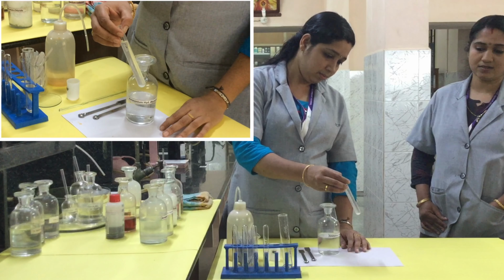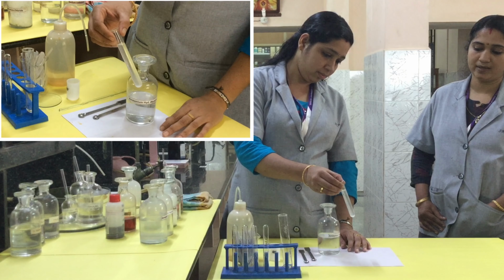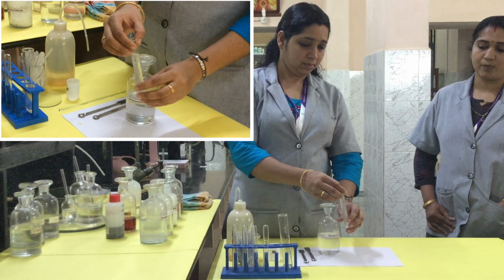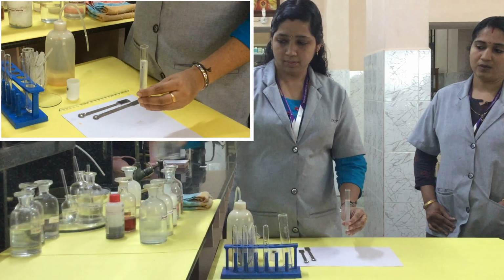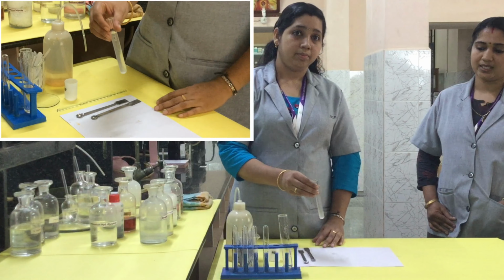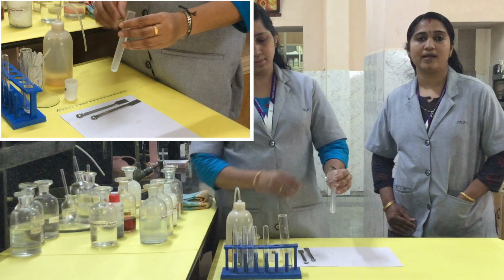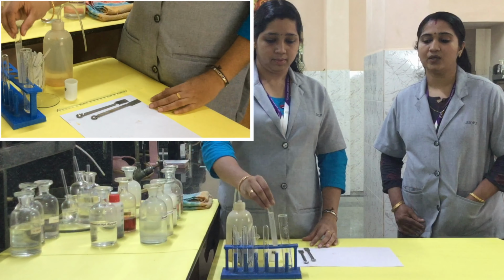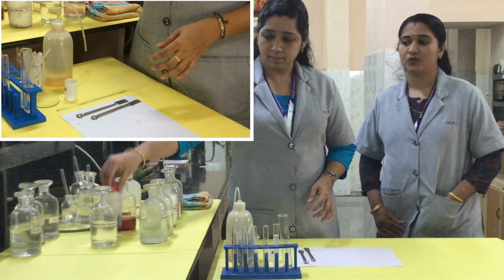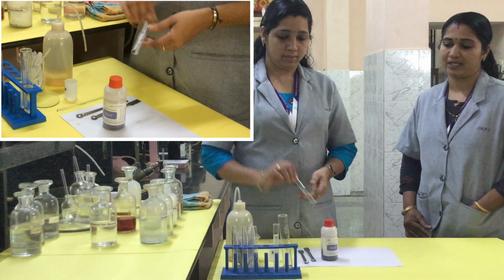To the salt solution we added solid ammonium chloride, ammonium hydroxide and ammonium hydrogen phosphate. Now observe the white residue that is formed, which indicates the presence of group 6. Now we want to check whether this group 6 contains magnesium. For that, we have to do the confirmatory tests for magnesium.